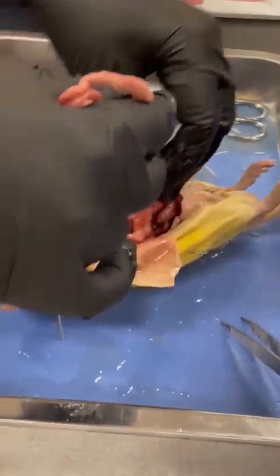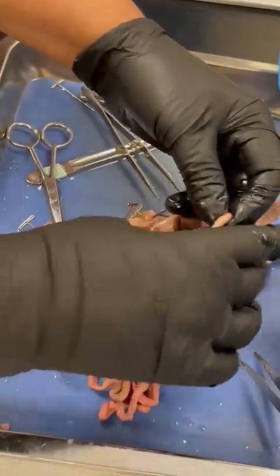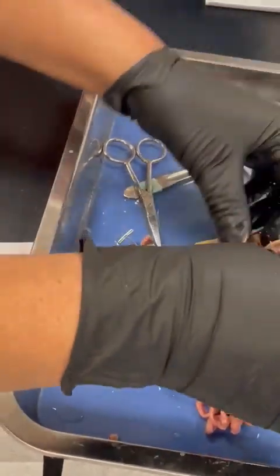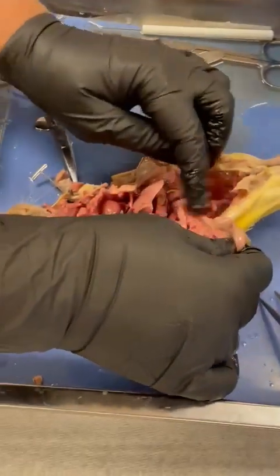This is intestine. Small or large? That's small. And now starts the large. The thick ones are the large intestine. So this is the cecum. This is the beginning of the large intestine, the cecum, and then it goes into the colon.